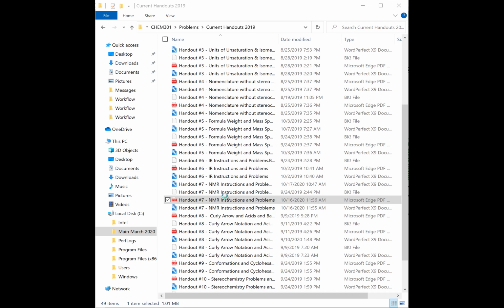And before I go further, these actually have substitution pattern names. So let me draw a little picture for you. So if we have a reference, which is A, to the right and left of A, this is called ortho. So if you're right next to it or adjacent. If you're one away, ooh, let's use lime green. If you're one away, that is called meta.